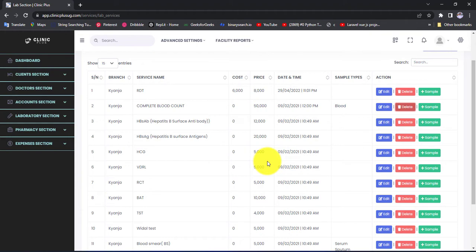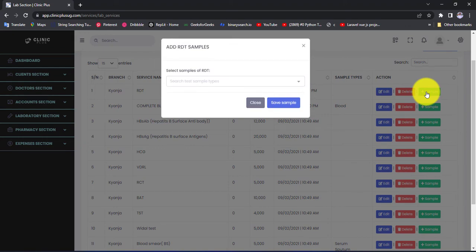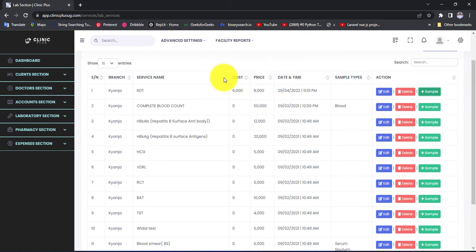There is something else I want to show you before we close off this video. There is a button here called Add Sample, shown in green. Samples are the things used to make a test — for example, for RDT we expect a sample of blood. That blood is taken into the laboratory and a test is made on it, then we get a result depending on the sample provided. Adding a sample is very important in the laboratory — you match a sample to a service.